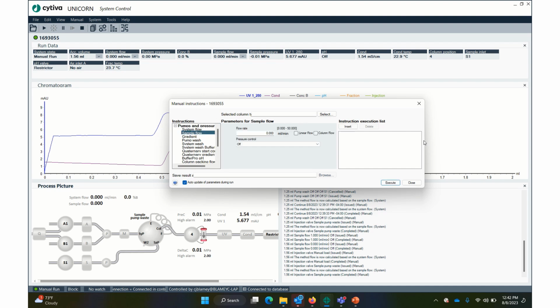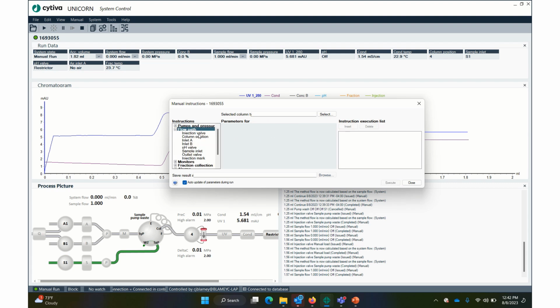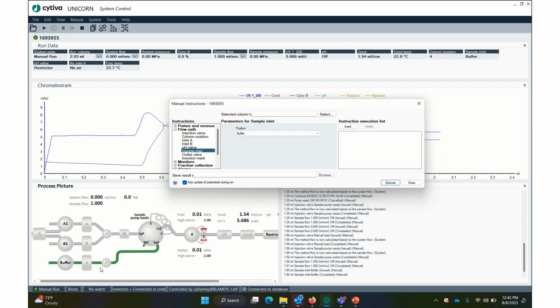Okay, so the tube is actually in the sample, and we're going to turn on the flow to 1 milliliter a minute. All right, now that that air bubble has gone into the valve, we're going to change the valve back to the buffer position. We have to hurry, time is a factor here. Buffer, execute. All right, we're going to let this run a little bit just to clear the sample pump of any air that's in there.